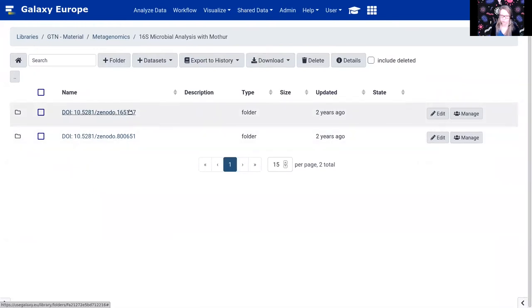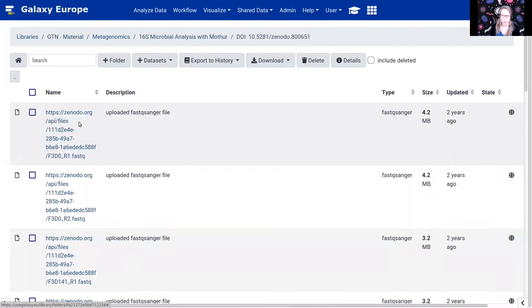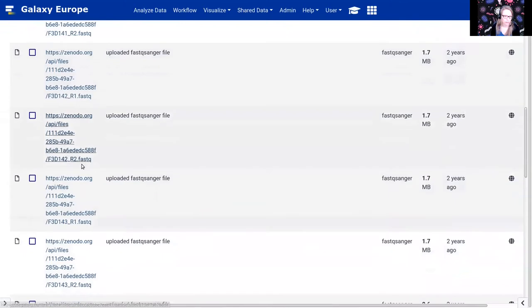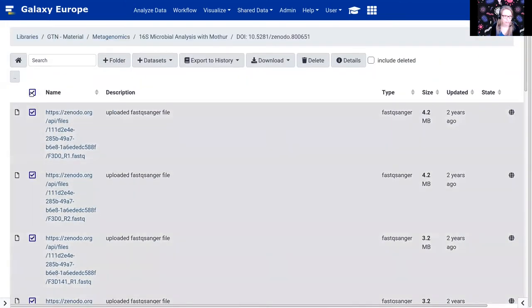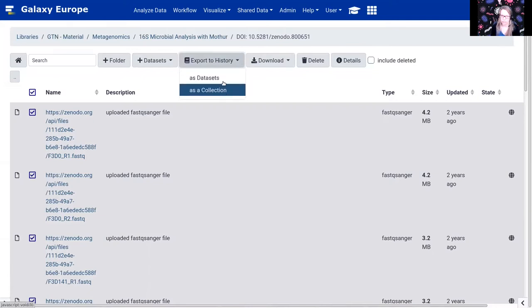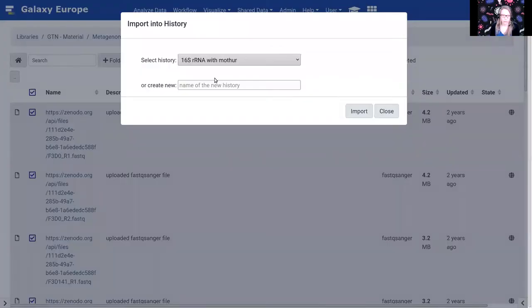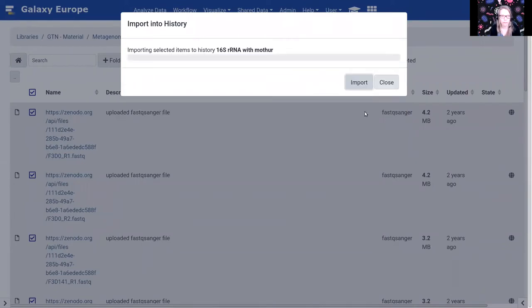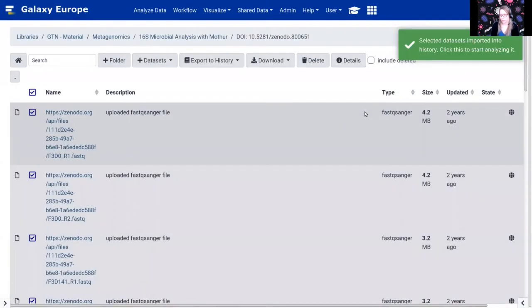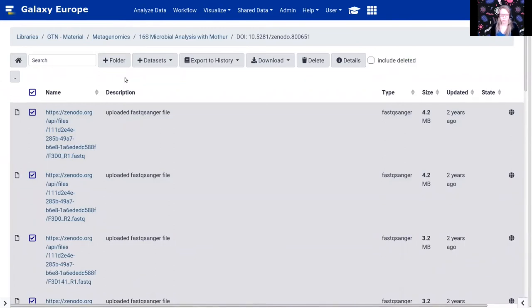The nice thing about using data from the shared data library is that it doesn't count against your quota, it's faster than uploading from a URL, and it saves space on the server. Once you see the green checkbox indicating everything went all right, go back to the main page by clicking Analyze Data. You should now see 46 files in your history: 40 FASTQ sample files and some extra reference datasets we will use later in the tutorial.